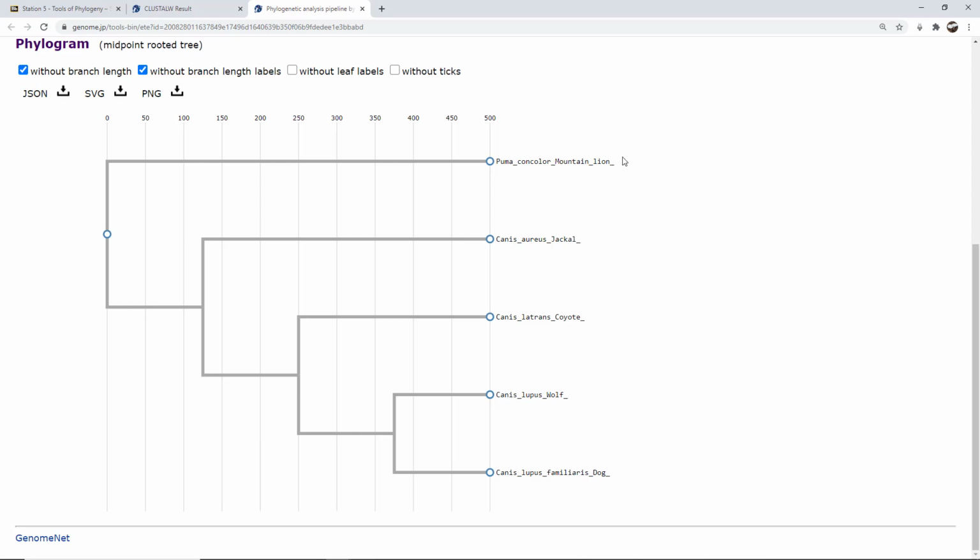And I think the results are really well demonstrated here. Depending upon what groups you're looking at, sometimes this can be very complicated, but for our demonstration purposes, it turned out very well, and we would be very happy with our results.